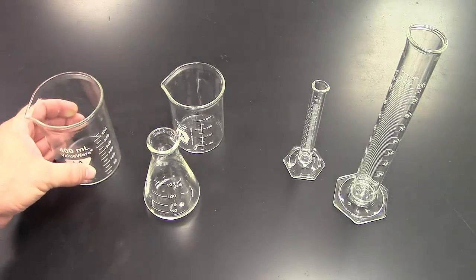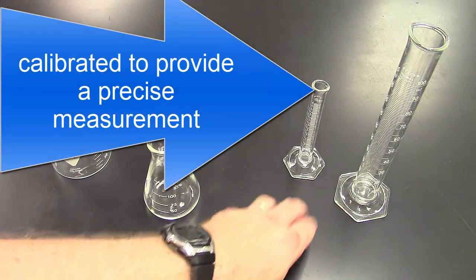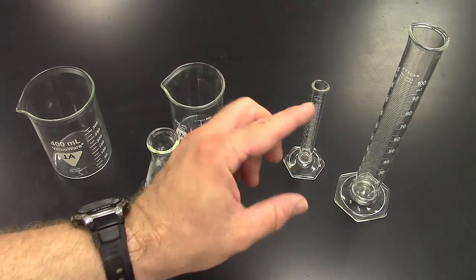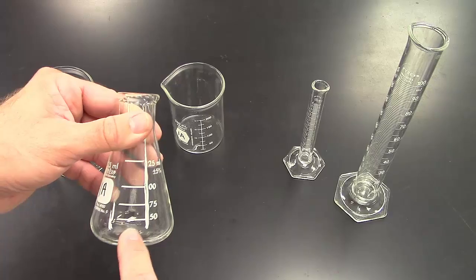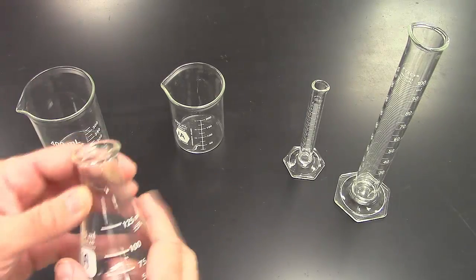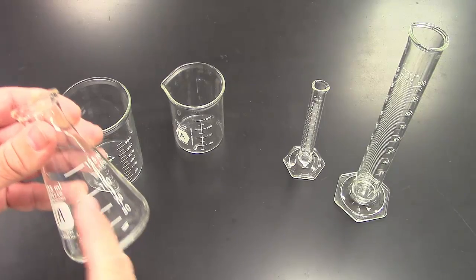However, in contrast, you see these items over here are graduated cylinders. They are calibrated to ensure that when the meniscus falls on a certain line, it's going to be plus or minus a very small range. So you have a flask, again, not very good. And look how it changes, because remember, a flask even has an angled wall. This is even worse than having a beaker because you're having to estimate these different lines are at different spacings.